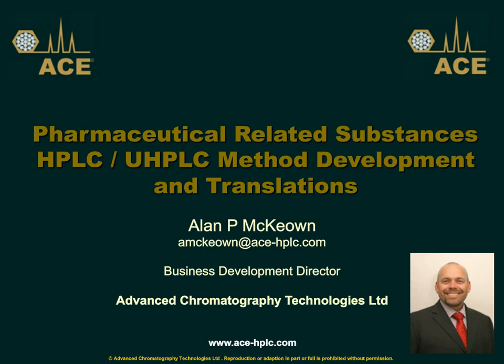protocol that you use to understand your different columns and their bonded phases. The protocol that we use at our company is based on what's called the Tanaka protocol, and this uses a mixture of triphenylene and O-terphenyl, which give you an indicator of value for what's termed shape selectivity. And what that means is the ability of those two analytes in that mixture, in that characterization of your bonded phase, to actually interact and be retained with the stationary phase.